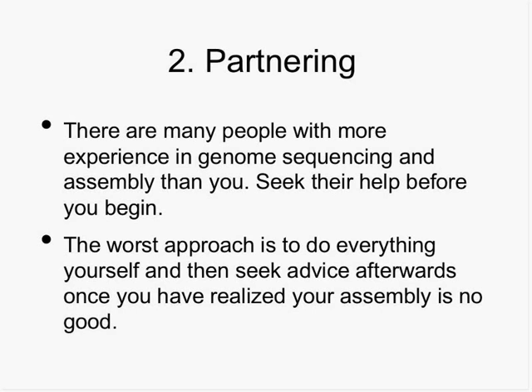And I would not do that. There are companies like DNASTAR, there are sequencing centers like JGI or Broad or Sanger Center or whatever. Find somebody who's done this before and get their help. Don't go off on your own. That probably applies more than just sequence assembly, but definitely here.